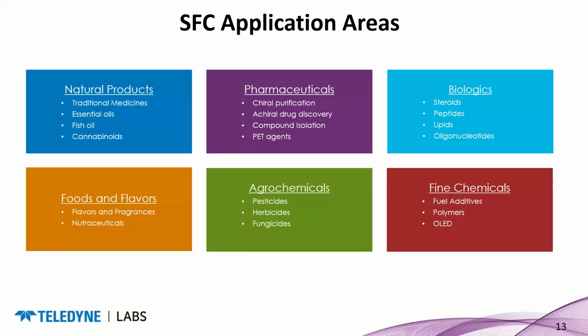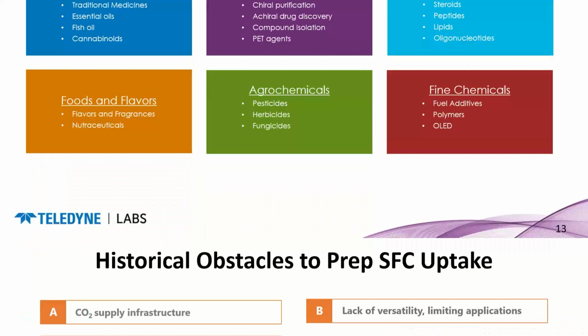There are a number of application areas. I'm not going to go into detail other than we mentioned natural products earlier. Pharmaceuticals, it's applicable to some biologics work as well. Food and flavor industry uses it heavily for extraction especially, but also chromatography. Agrochemicals and the fine chemicals industry.